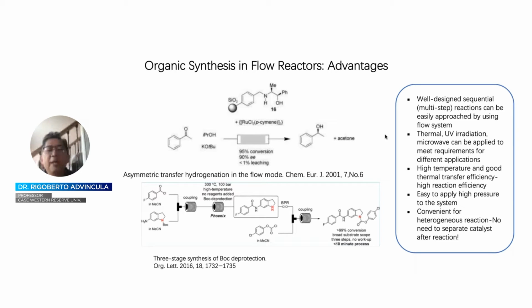On the other hand, this is of interest to pharmaceutical chemists in order to increase the yield so that they can use more of the same material for the succeeding reactions and therefore increase the overall yield. So this is, for example, shown in these hydrogenation reactions on these intermediates to give you the final conversion product, let's say with high EE in the case of the reduction of this ketone to the corresponding alcohol, or below in terms of the coupling reaction to provide you this coupled intermediate product.